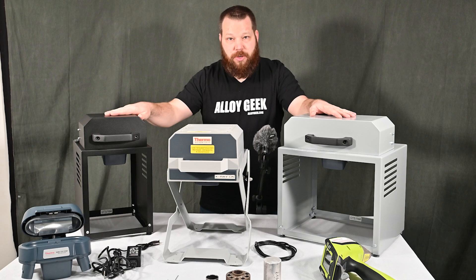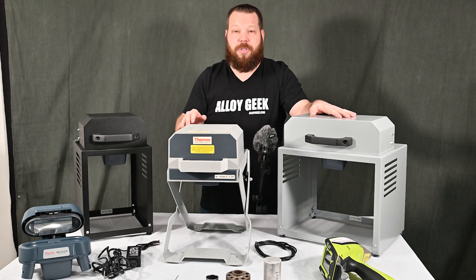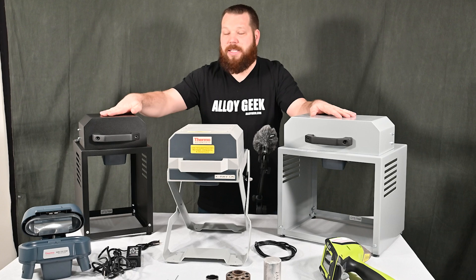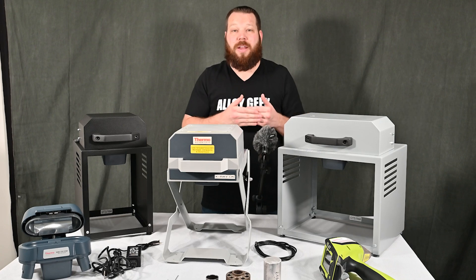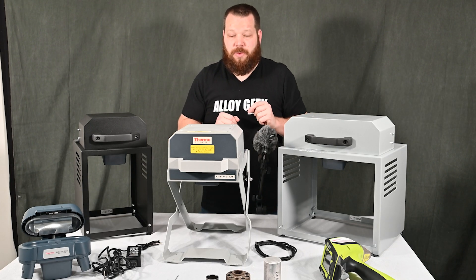We're going to talk about the features of each of these test stands and why you might pick each one. I have a personal favorite — it's small. When you're using a test stand, typically you're in a laboratory environment, and the newer test stands remove all the legacy hardware — you don't have to plug them into a power outlet or anything like that — and they integrate with the RFID features of the Niton XL2 and XL3T.